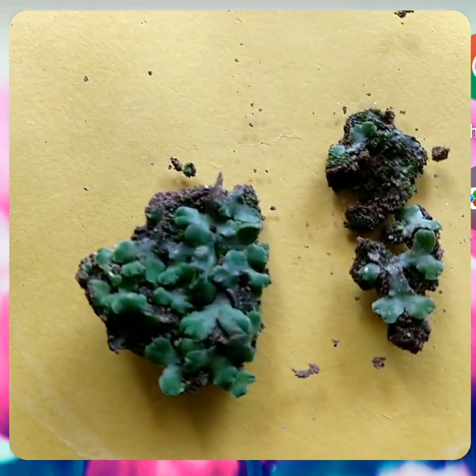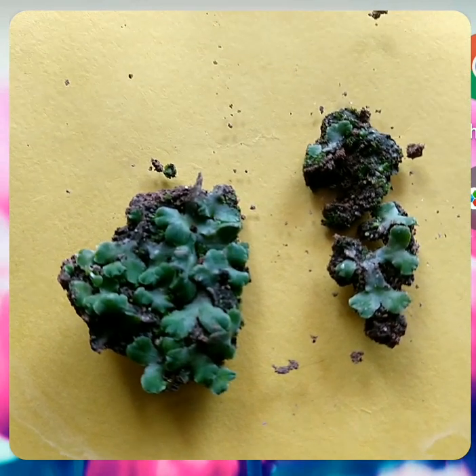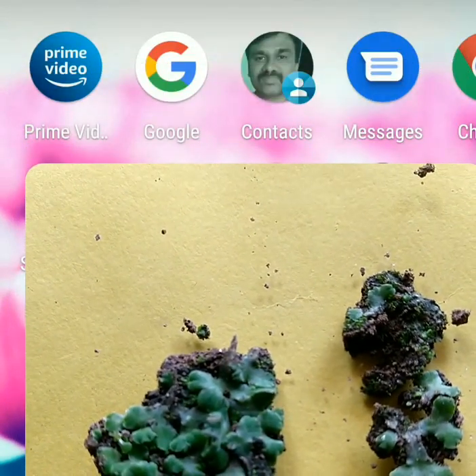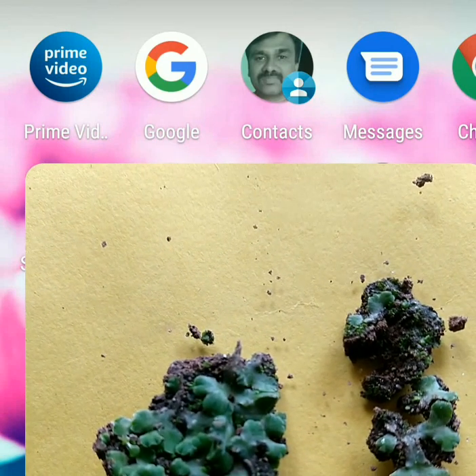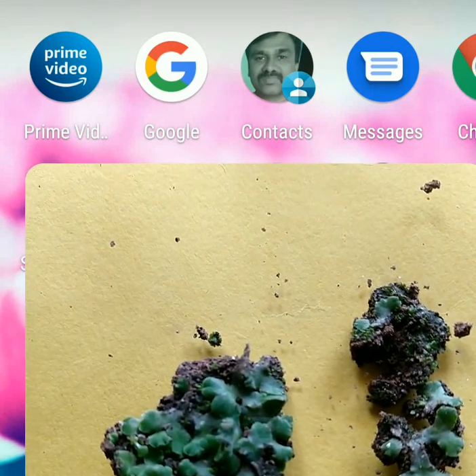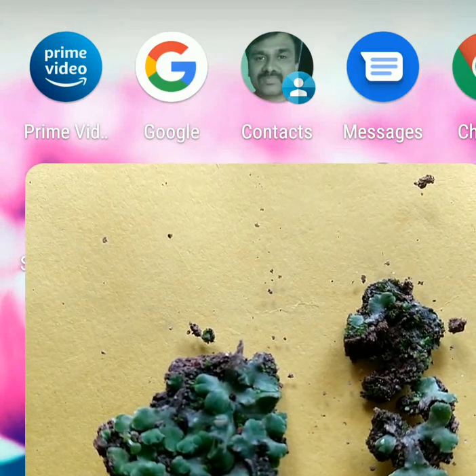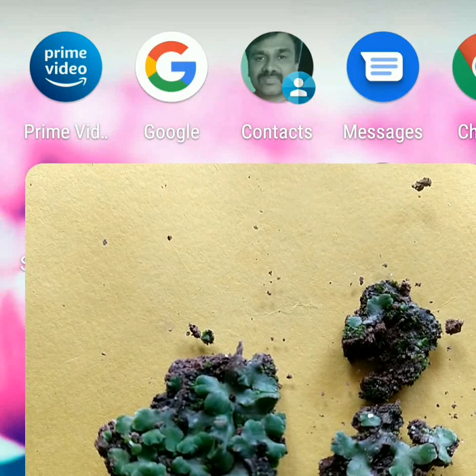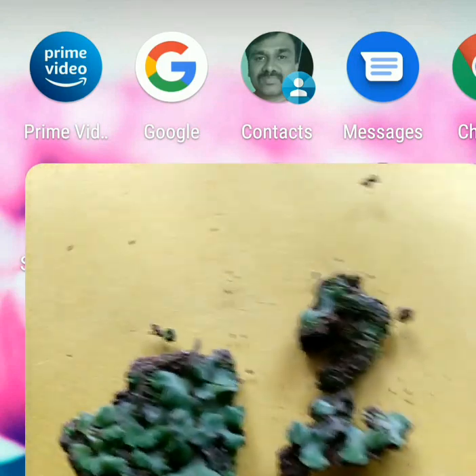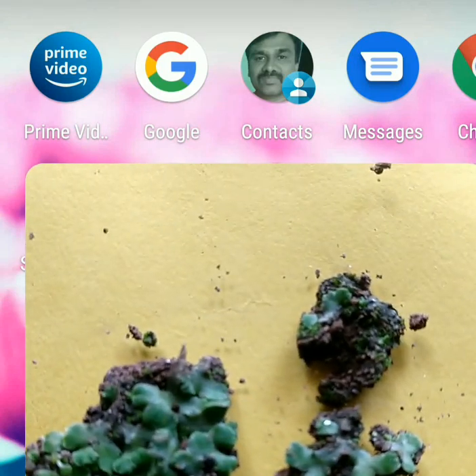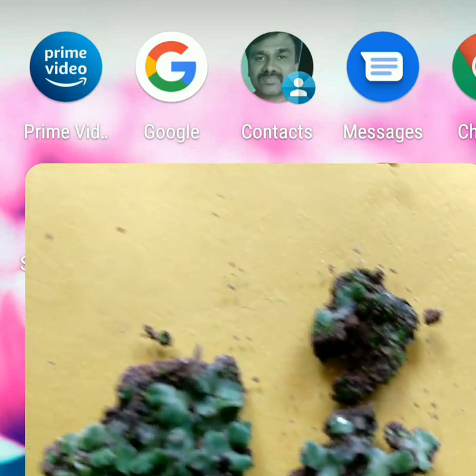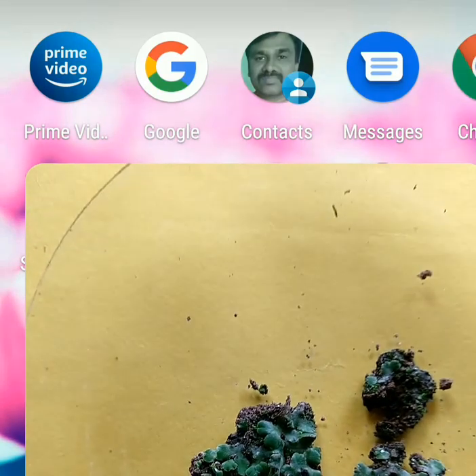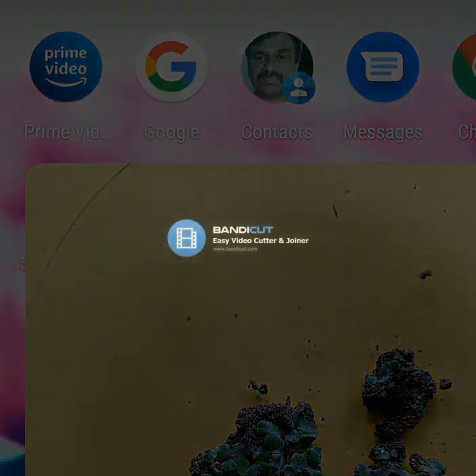Both types of rhizoids are helpful in absorption and anchorage. As you can see in the specimen, it is fleshy and has a flattened structure — that is why this plant is commonly known as liverwort. So members of Hepaticopsida are commonly called liverworts, by which you can identify them.